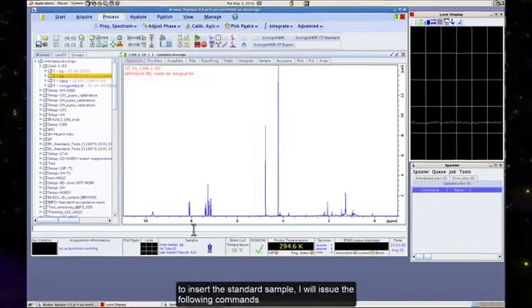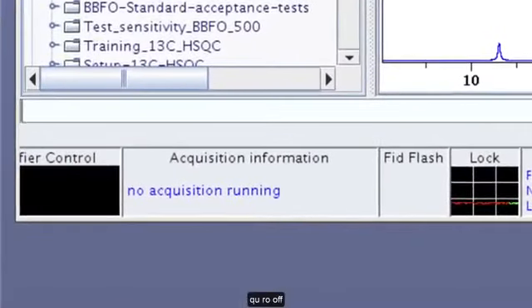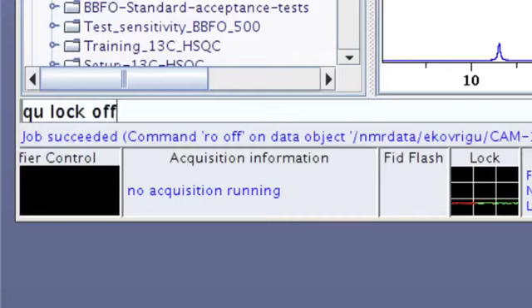Filling the tube: the ideal sample height is 4 cm, which covers the RF coil. Never overfill. Excess sample can spill into the probe rotor and contaminate it, leading to poor spinning and shimming.